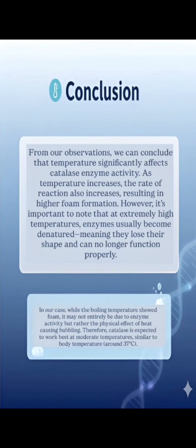In our case, while the boiling temperature showed foam, it may not entirely be due to enzyme activity, but rather the physical effects of heat causing bubbling. Therefore, catalase is expected to work best at moderate temperatures, similar to body temperature, around 37 degrees Celsius.